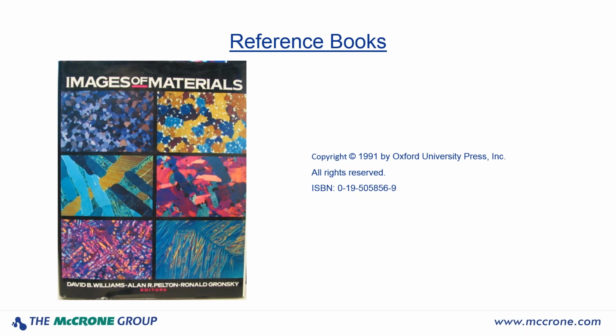The first 50 pages are his chapter, and then after that, it has all kinds of images from different techniques: scanning electron microscopy, transmission electron microscopy, X-ray diffraction, and so forth. Lots of different material images by various other instrumental techniques. Another outstanding reference book.